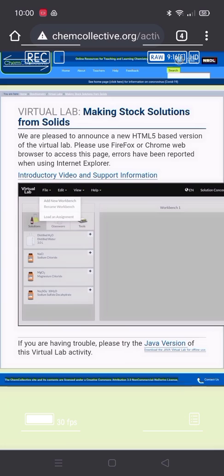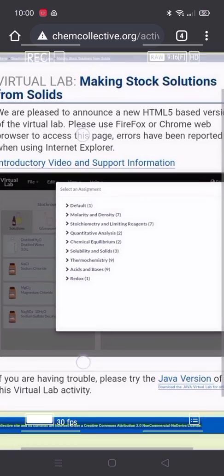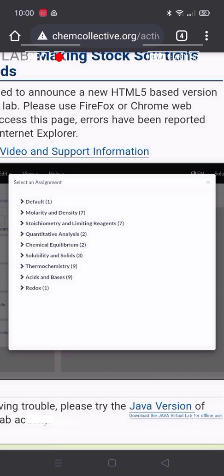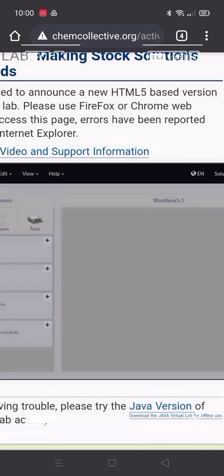Let's start. Click File, Load an Assignment, and the topic: Stoichiometry and Limiting Reagents — the Jell-O Problem.